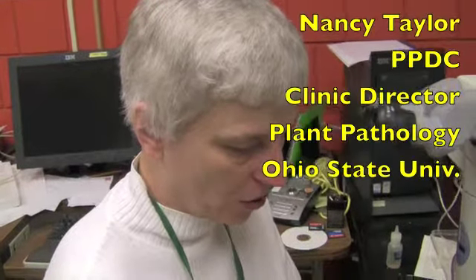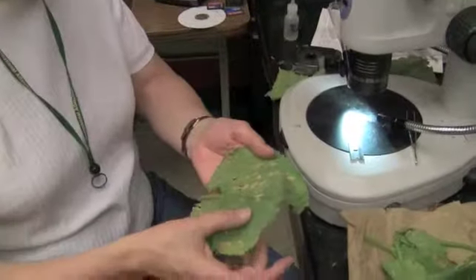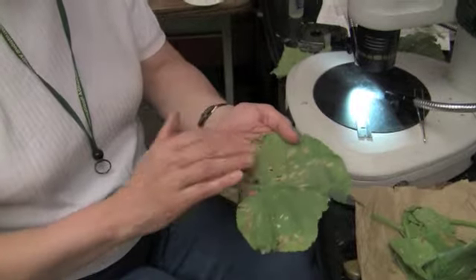So what we're going to do is incubate the leaves overnight and see if any fungi develop that will allow me to identify it more specifically. And so there are lots of different ways to do this. One of the ways that we use in our lab is what we call a moist chamber box.